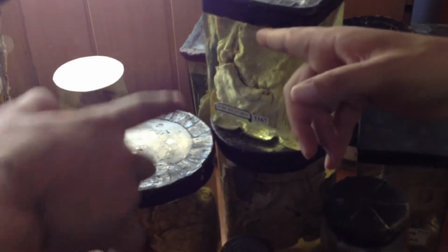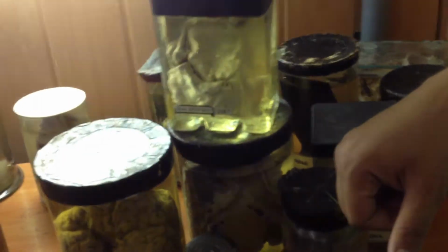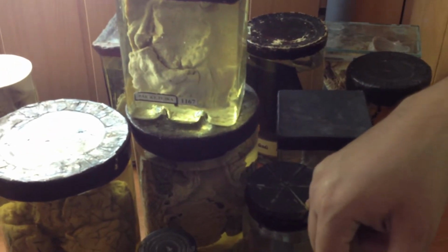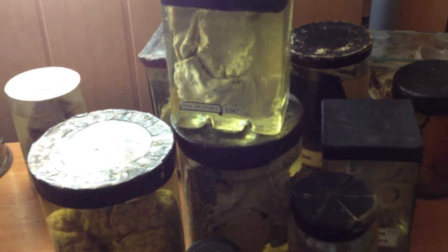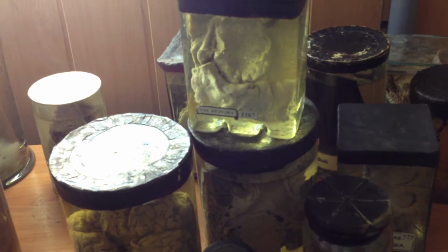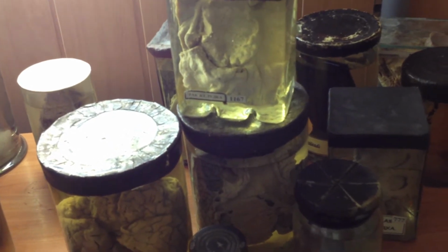What are these features? What else? This one. This is the cancer of the stomach. So, the specimen is presented with a part of the stomach, and we can see a formation without clear borders, with ulceration. So you can actually make an assumption that maybe this cancer has developed on the border of the ulcer, a pre-existing chronic ulcer.